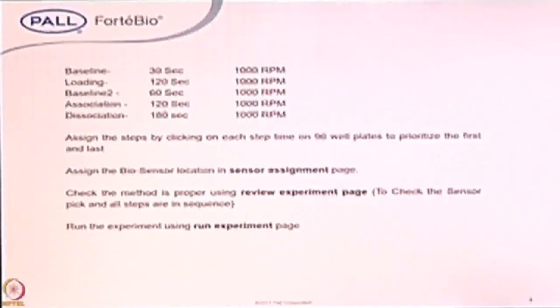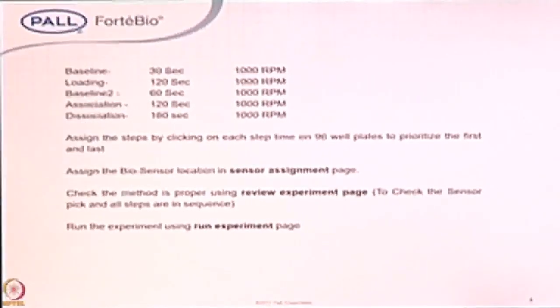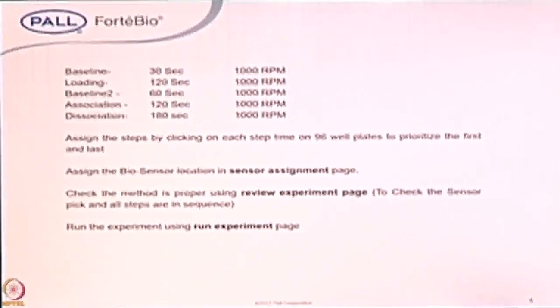And these are the concentrations, very simple. I'm taking the time around 30 seconds as my baseline time. And for the 120 seconds, I will look at the loading, how much load happens on that. And the software has a compatibility, like you can extend the time during the acquisition itself if you want some more time, it is possible. Or if you see that a saturation happens, then you want to just jump to the next step, yes, that is also possible.